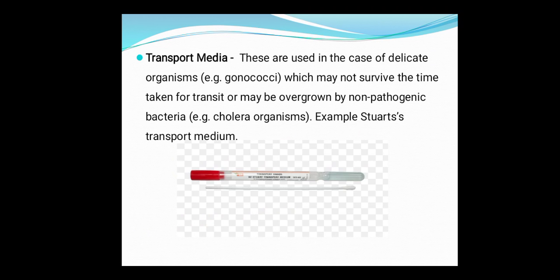Last but not least, we have transport media. This transport media is used in the case of delicate organisms, for example, gonococci.